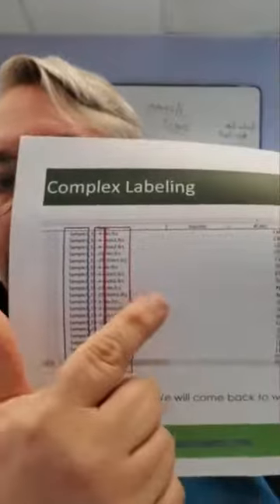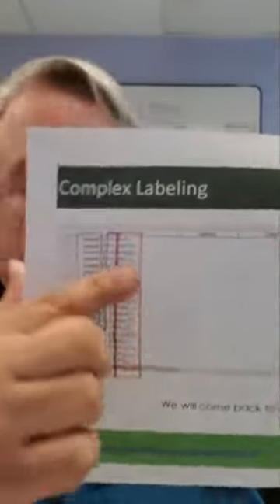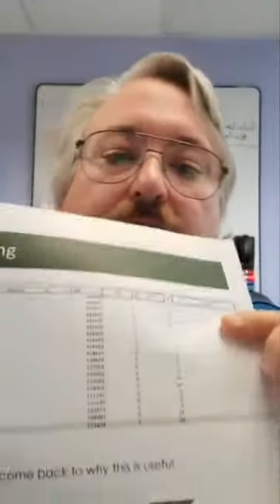Now, another way to think about it is complex keywording. A lot of people will bury details of the experiment in the name of the file. So in this case, I'll show you, we named the type of stimulation, how long the stimulation was run, and we had two different stimulations and two different time points. So what we're able to do is, using that add keyword, add three keywords. As you can see here, this is the file name, and I've highlighted the three columns, and we're able to add those three columns.